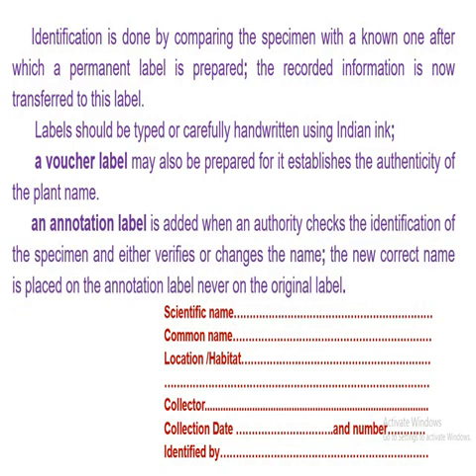Now the new correct name is never placed on the original label, it's placed on the annotation label. And that's what you need to do to prepare an herbarium specimen.